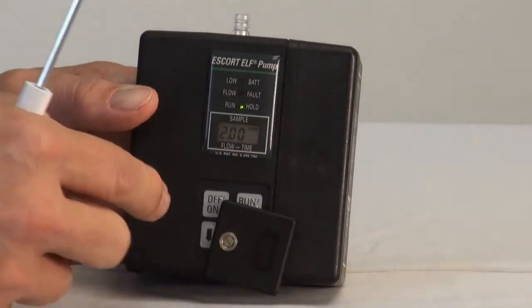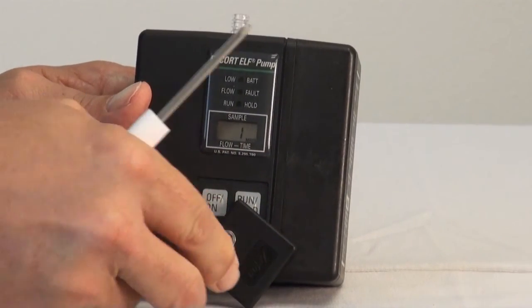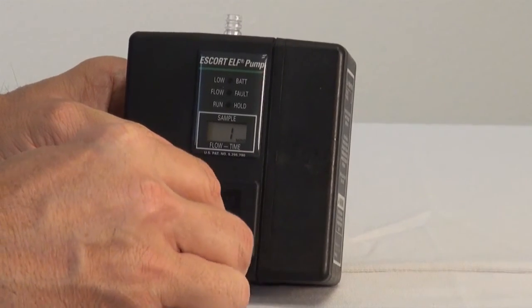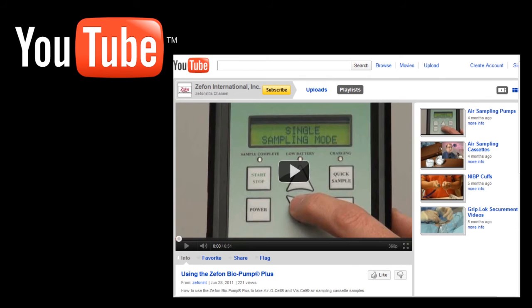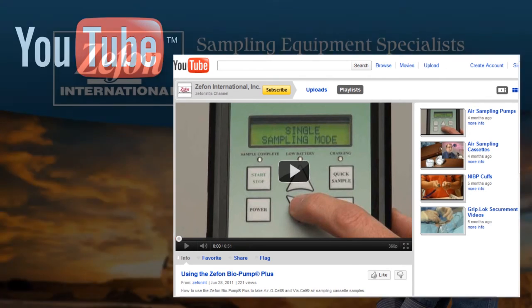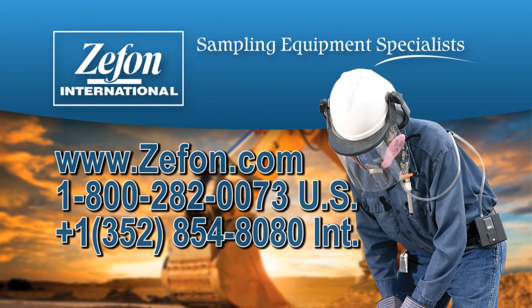To turn the pump off, press and hold the on-off button until the pump shuts down. The LCD display will show the elapsed time of the total sampled minutes. Additional Escort videos from Zeffon International are available on YouTube. For more information, visit us at www.zeffon.com. You can call us toll-free from within the United States at 1-800-282-0073, or internationally at 1-352-854-8080.